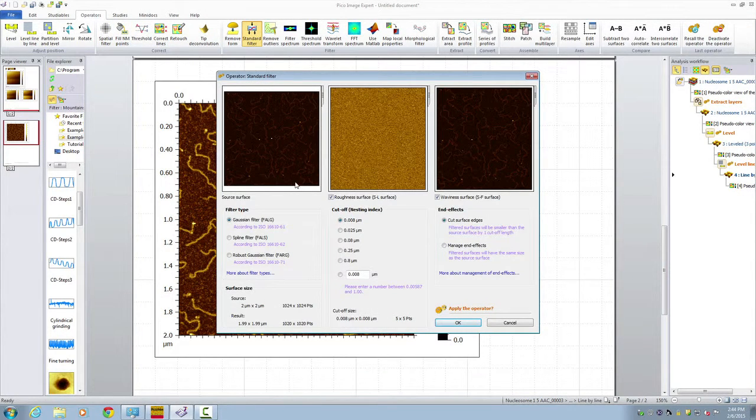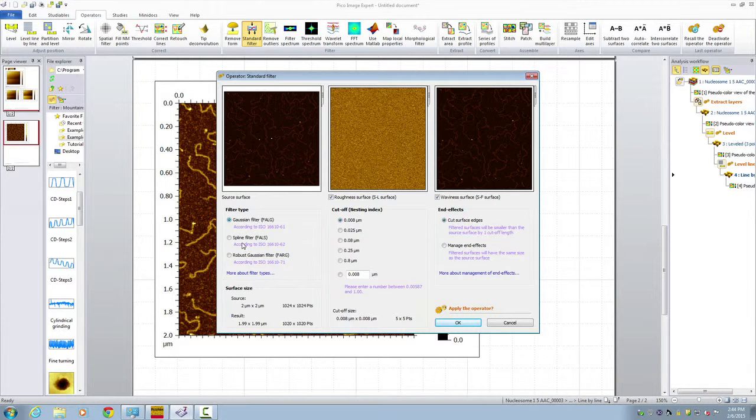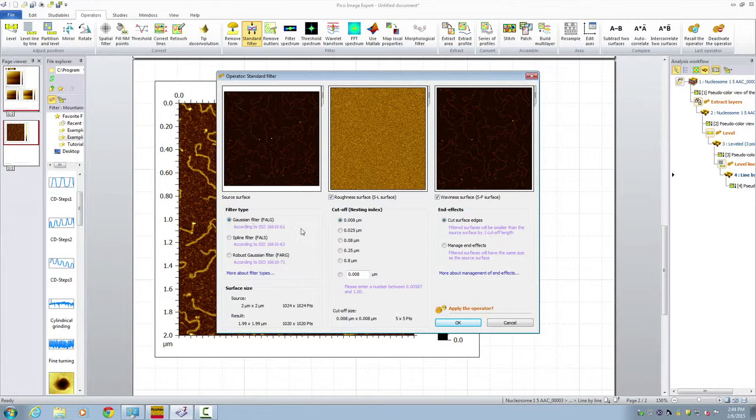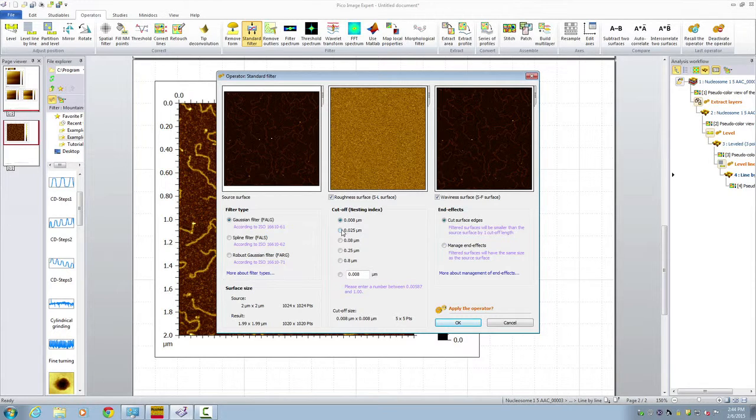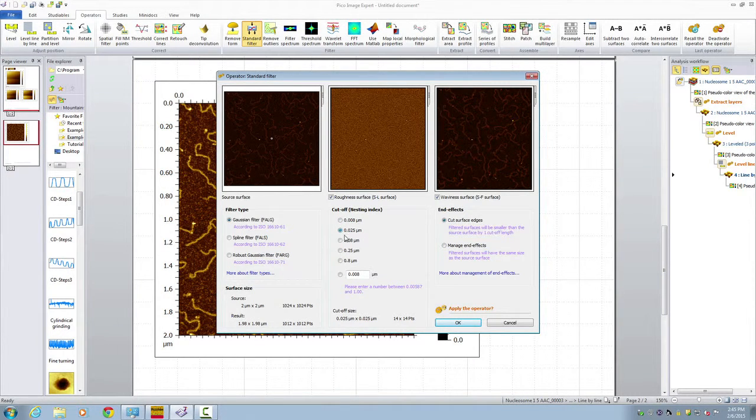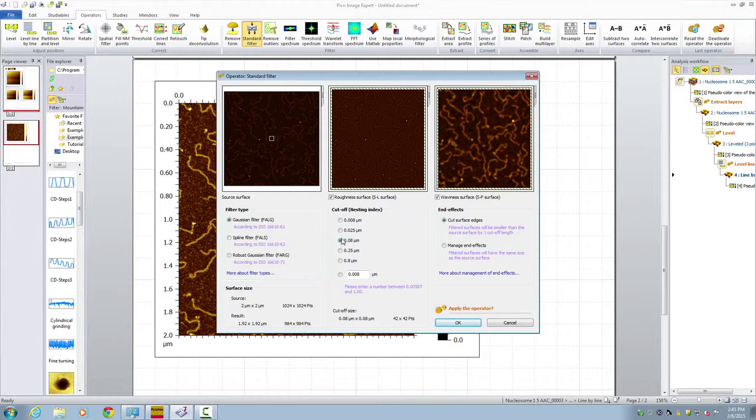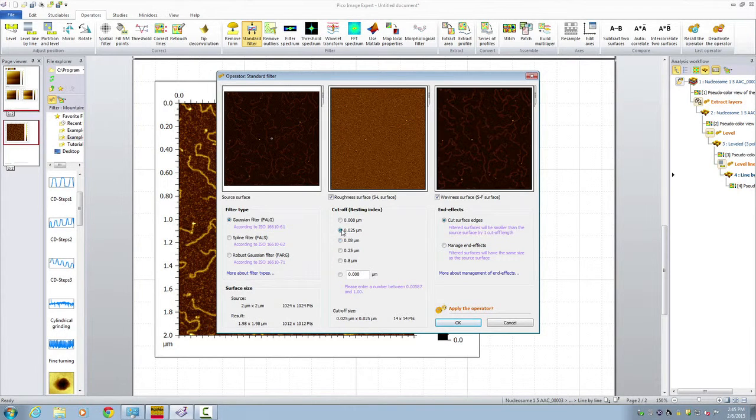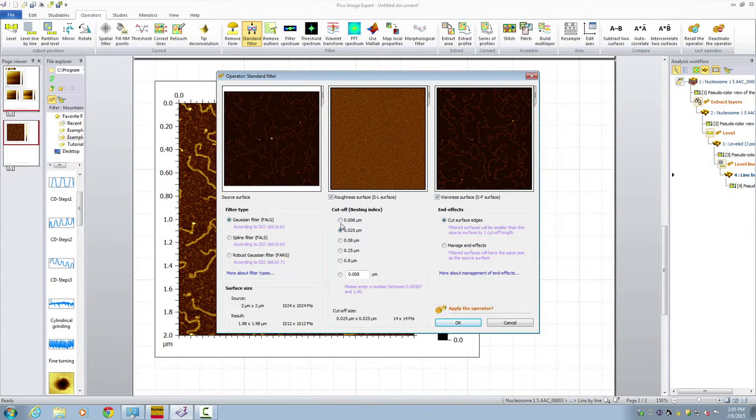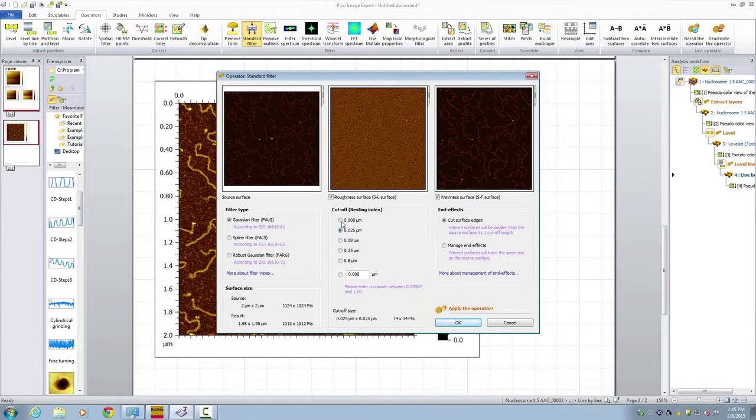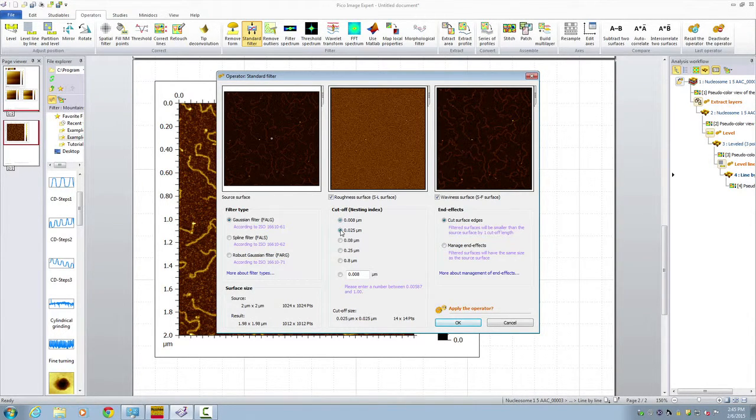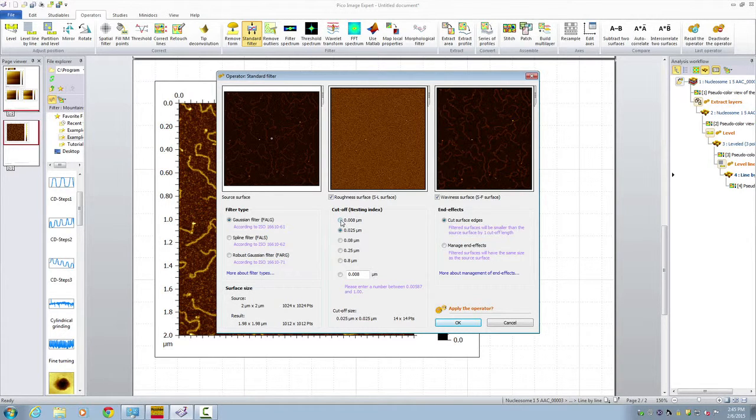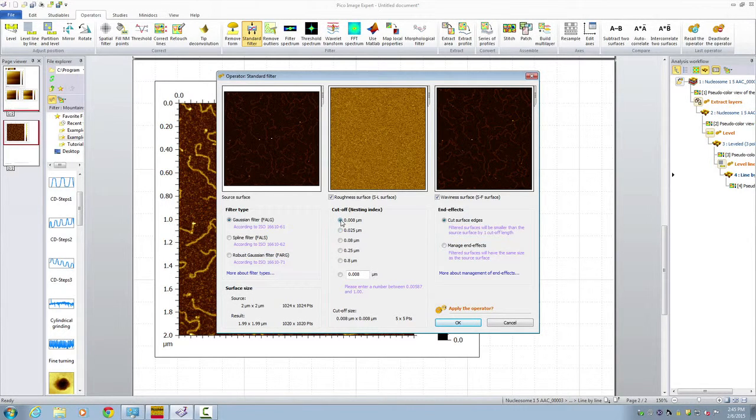And here, you could choose three different types. The Gaussian filter, the splinter filter, a robust Gaussian filter. The Gaussian filter is mostly used. And then here, we choose a cutoff frequency. Basically, you want to choose how big is the feature is considered to be feature, and how small is considered to be noise. When you choose a large number, the image will appear to be very smooth, but you can also lose information. If you choose a distance which is too small, then you're not sufficiently filtering out the noise. Here, we choose 0.008 micron, which is 8 nanometers. Click OK.